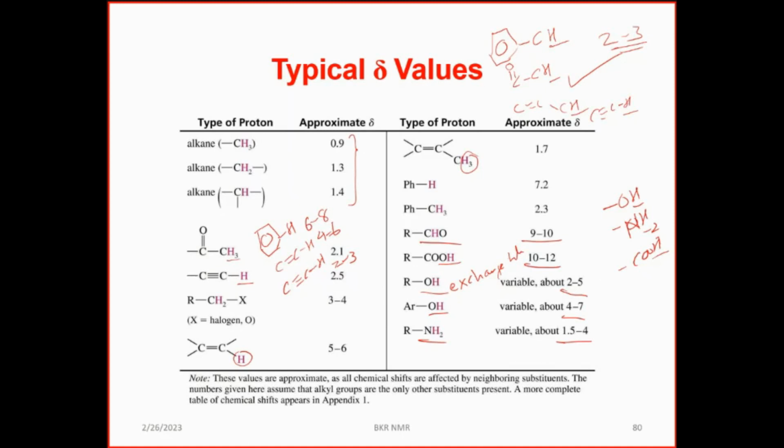How do we find such hydrogens? We use deuterated water. Suppose I have an exchangeable hydrogen and I use deuterated water. On exchange, I'll be getting R-OD plus HOD. So this HOD peak will be around 4 to 5.